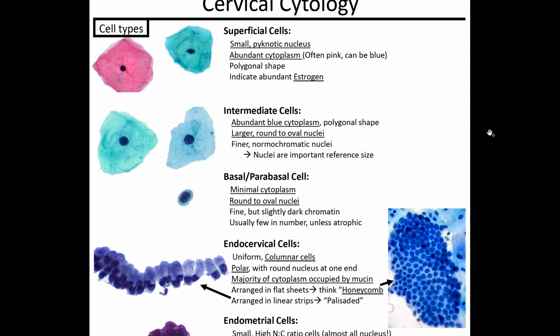But tonight I just wanted to go through the cervical cytology section from Kurt's notes. As I mentioned last time, I'm gearing up for my cytopathology rotation next week. So this is good review for me, and I haven't had a lot of cyto rotations, so I'm not an expert. I'm reviewing this and learning it myself as well. But I thought if I can capture this review session and anyone else can benefit from it, then I might as well record it. So first we're going to go through some cell types.